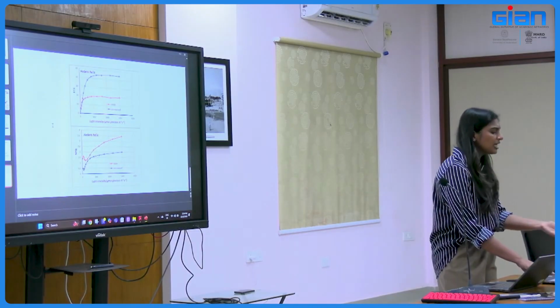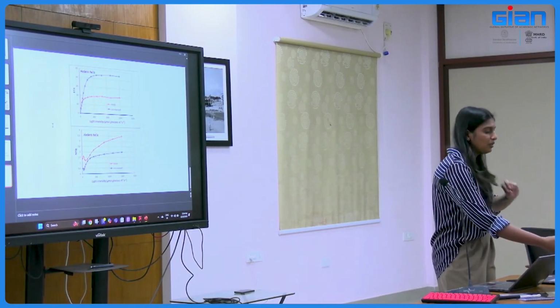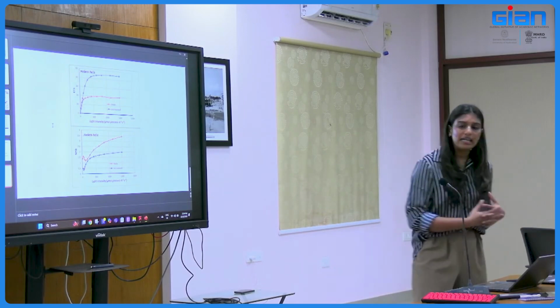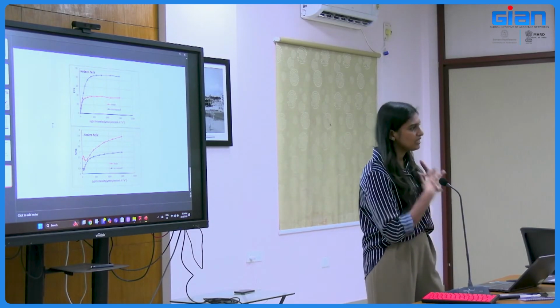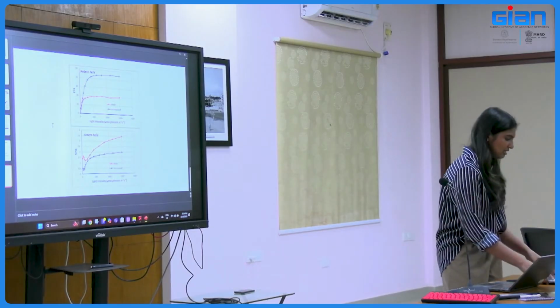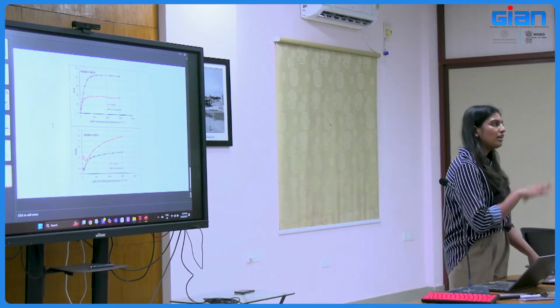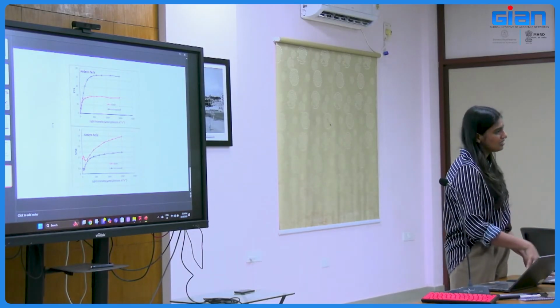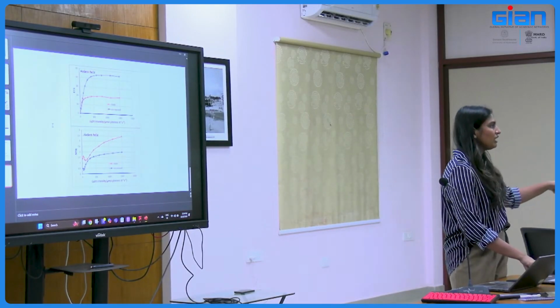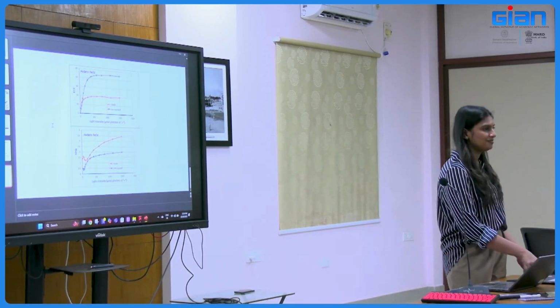We will see now how it is, and finally you can plot the graph like you can see here, electron transport rate and non-photochemical quenching. I think more than 10 parameters will be studied using only light curve signals, and you will see that down below now. That's it. If you have any doubt related to the theory part, you can ask now, or else we can go down. Tea, after tea.